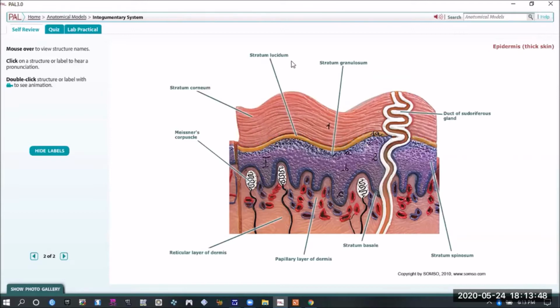The next shade, stratum granulosum. And after that, we can see the color change, representing now the stratum spinosum. And then finally, the deep edge, the stratum basale. And we'll just go in reverse to see all of those layers.